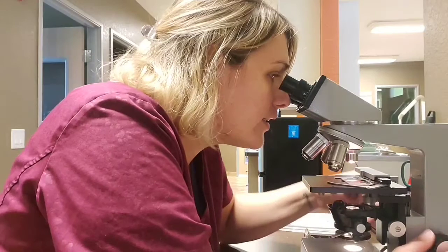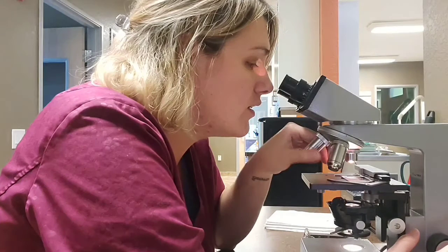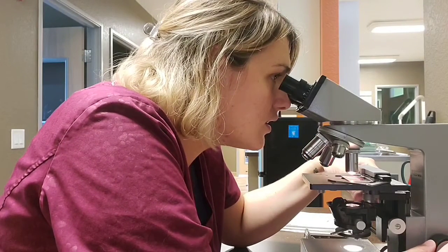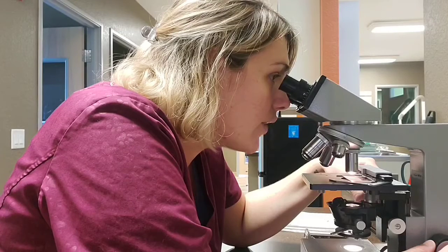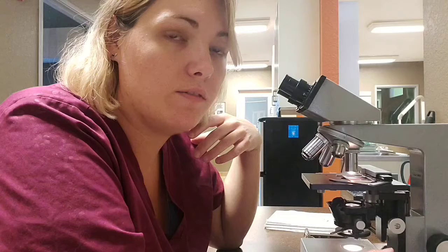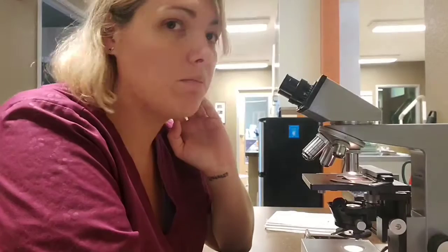All right. Let's get us all focused in here. All right, that's 10. And so on the 10 times magnification, which I have it on here, what we're looking for is any form of movement with the red blood cells and things like that, trying to see the microfilaria, which kind of come up a little clear in this. So the easiest way to detect that is with movement.